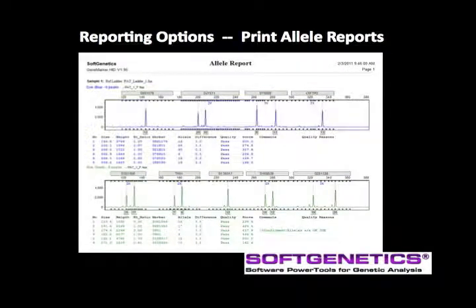We see here that allele 7 for TH01 was just below the heterozygous imbalance at 58%. This imbalance was set in the panel editor at 60%. The sample was flagged yellow with the quality reason imbalance. The analysis action, confirmed, and comments were recorded in the main analysis screen when the analyst made the decision to confirm the peak, automatically removing the yellow flagging and entering the actions under the comments heading.